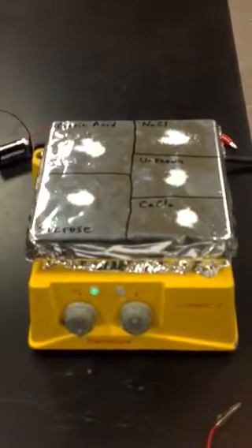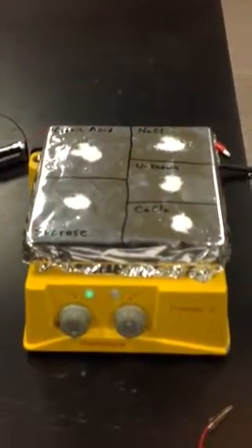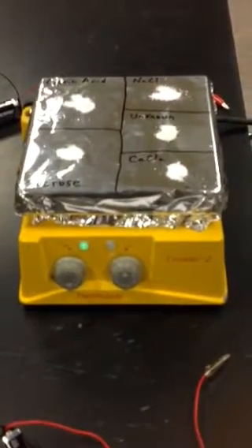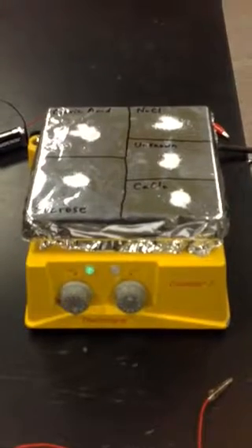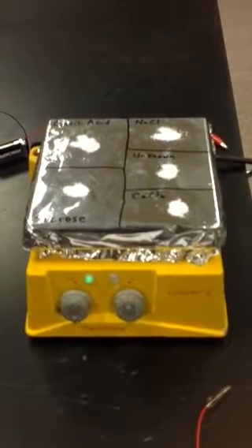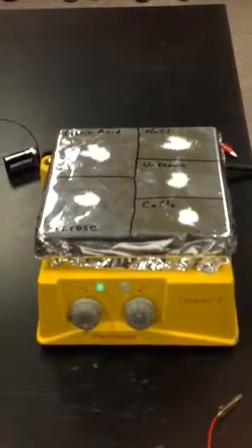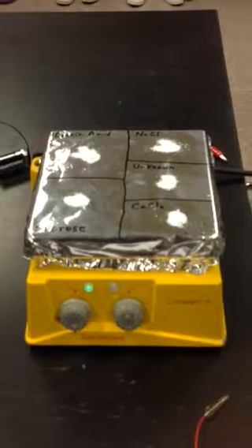But what we're looking for, remember we said it was relative. Obviously, I'm not going to get a temperature off of this. So what I need to do is say, okay, is something melting and in what order? Did the sodium chloride melt first? So we're trying to get an order of yes, it did melt, no, it did not melt.